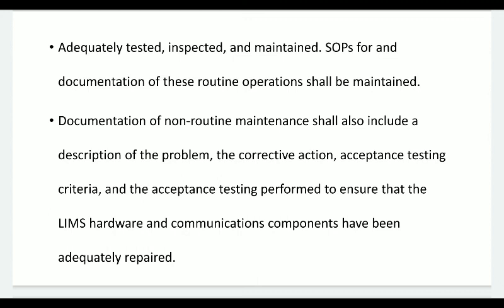Standard operating procedures for and documentation of these routine operations shall be maintained. So even if you are doing a maintenance activity, standard operating procedures are there, and you have to maintain proper documentation of each and every maintenance activity.